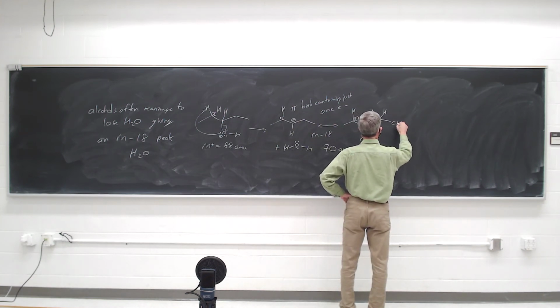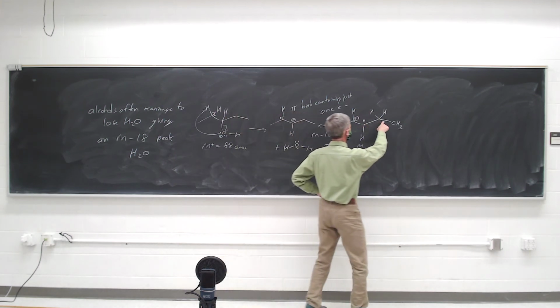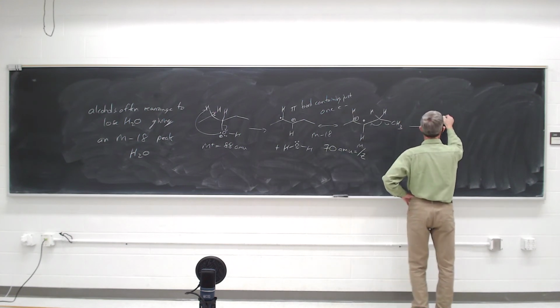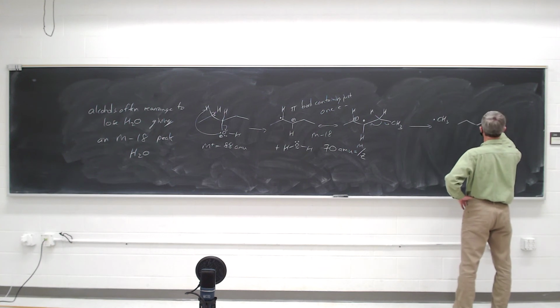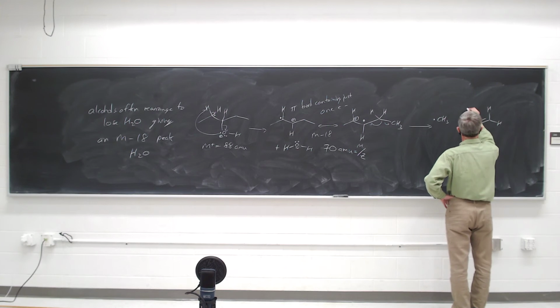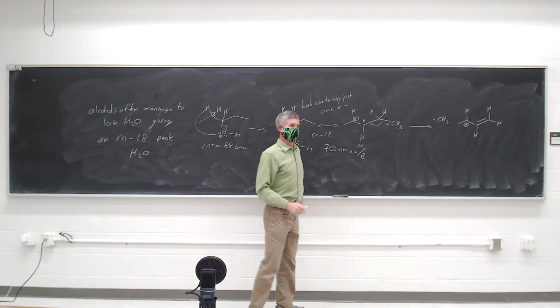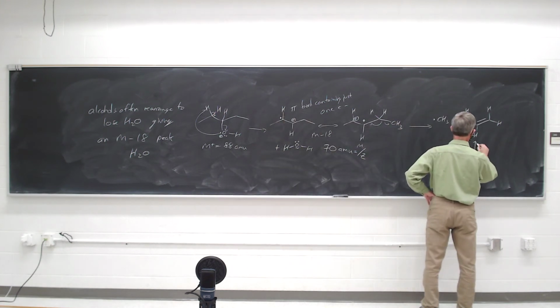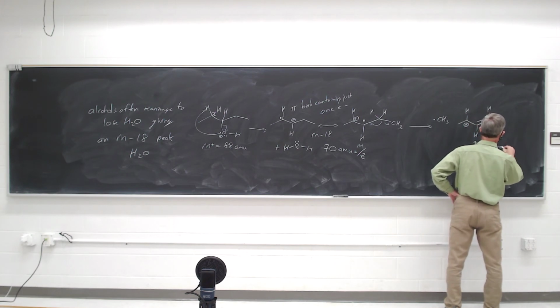And I think you can see that from this resonance form. If we were to cleave this bond and take out a methyl group, the other product would look like this. Take one electron from that carbon-carbon bond to the CH3, form a pi bond here, and this is a little bit resonance stabilized.